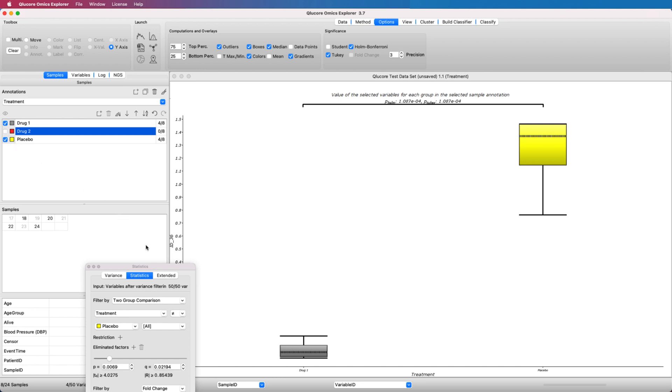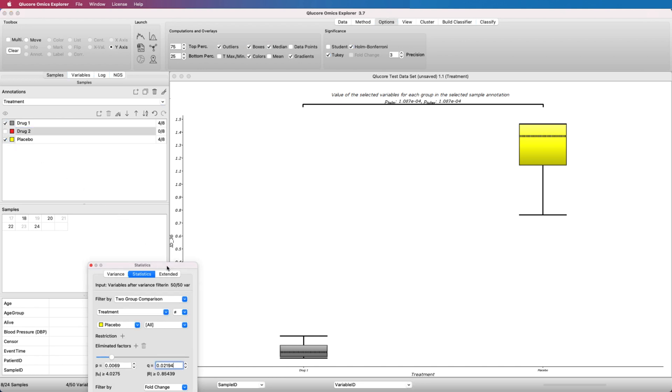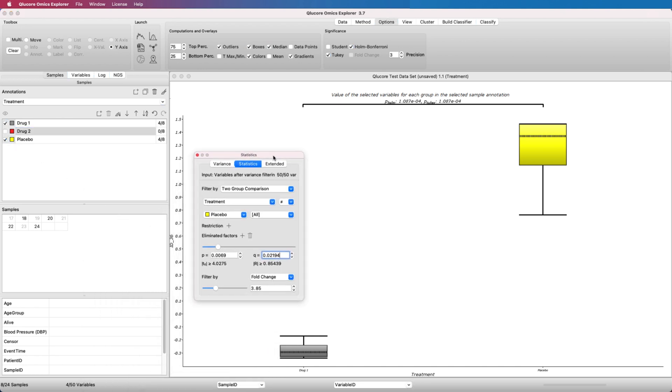To summarize, in this tutorial we have demonstrated how to identify discriminating variables using a t-test and Fold Change, to set up different types of plots, and to save results.